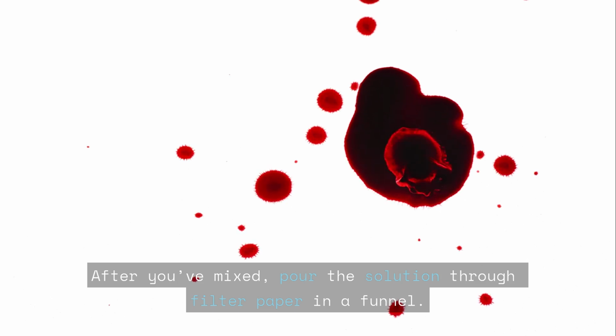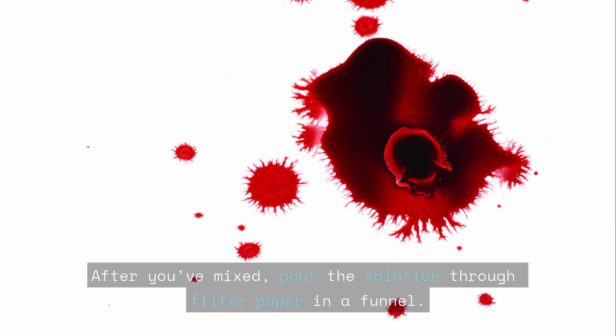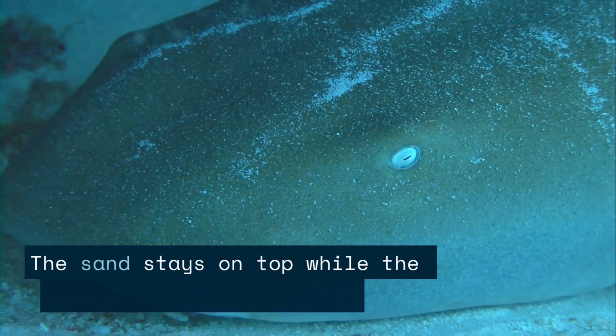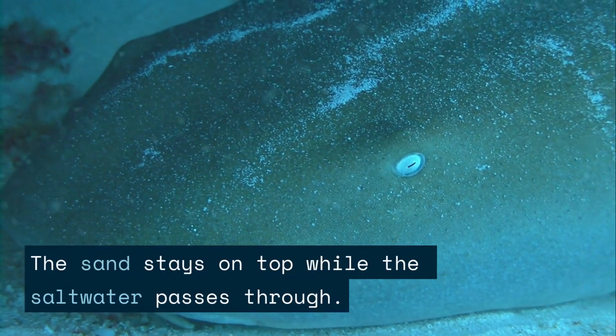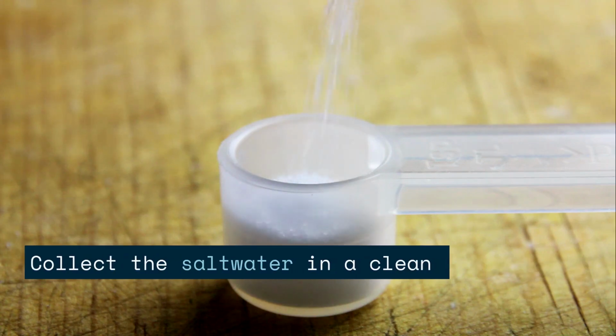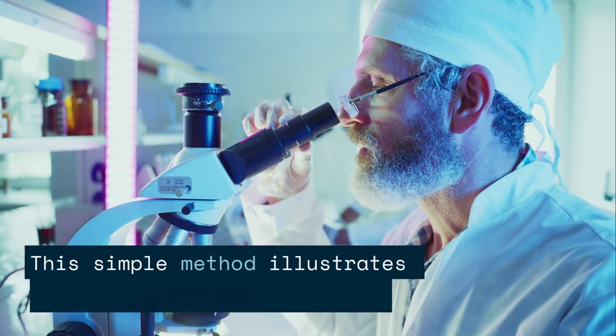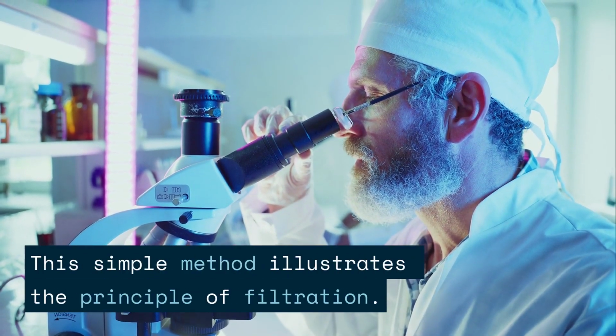After you've mixed, pour the solution through filter paper in a funnel. The sand stays on top while the salt water passes through. Collect the salt water in a clean container. This simple method illustrates the principle of filtration.